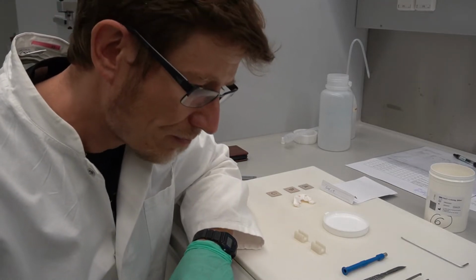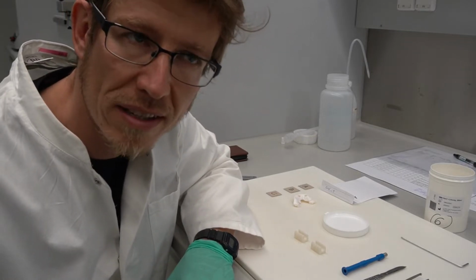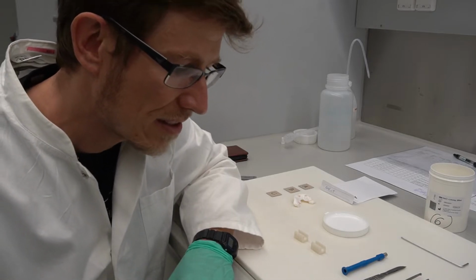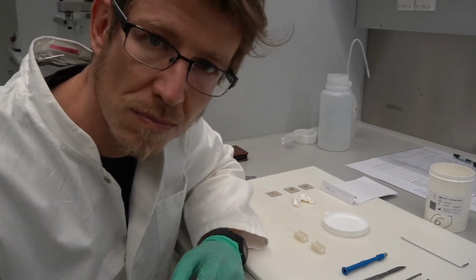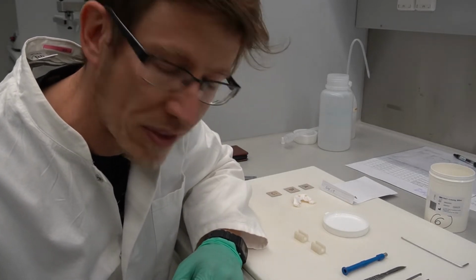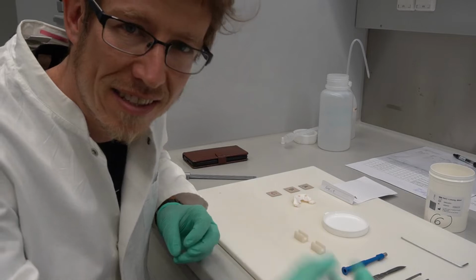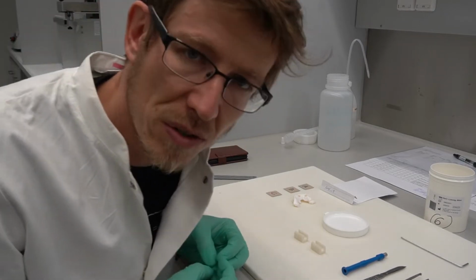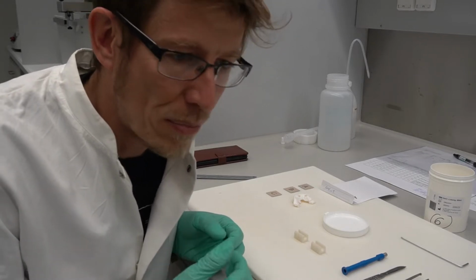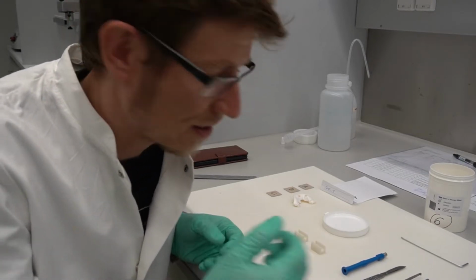it more resistant to decay, it is also stored, so other samples are stored at 26% of saline solution, and also another batch of samples is sterilized with a certain process that is conducted at a company we are collaborating with. So we have meniscus tissue at different preparation or processing stages, and the question is how the viscoelastic properties are changing. Is the tissue degrading? How is damping and stiffness changing depending on the storage medium or the processing stages?